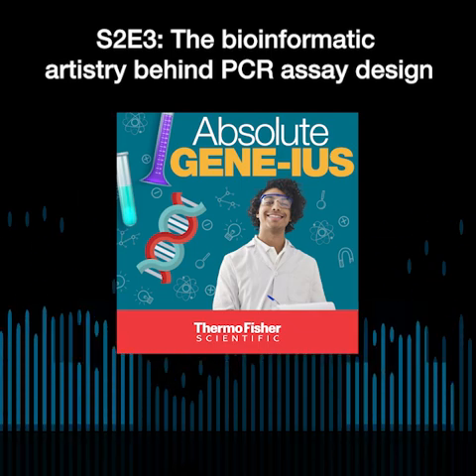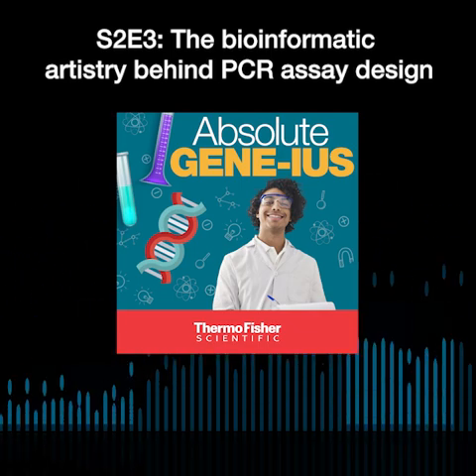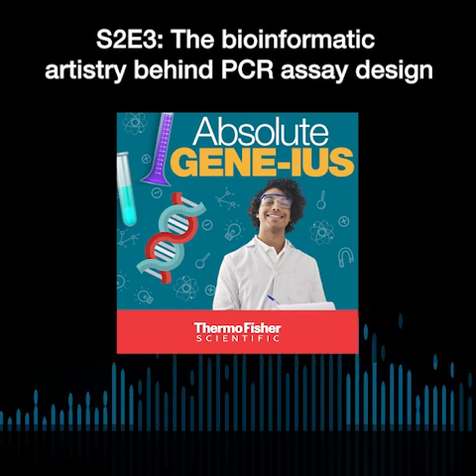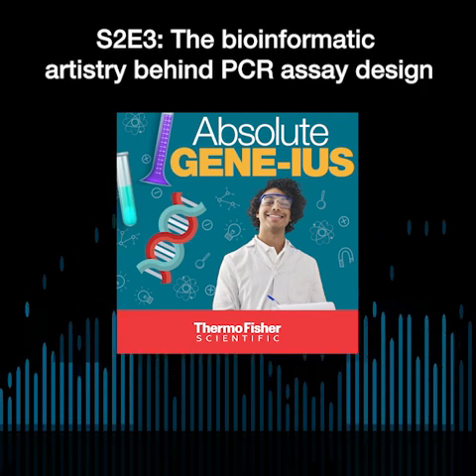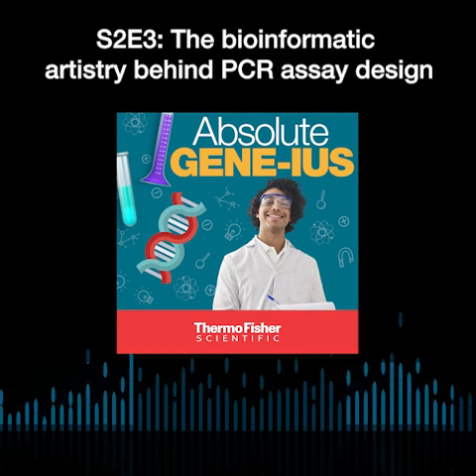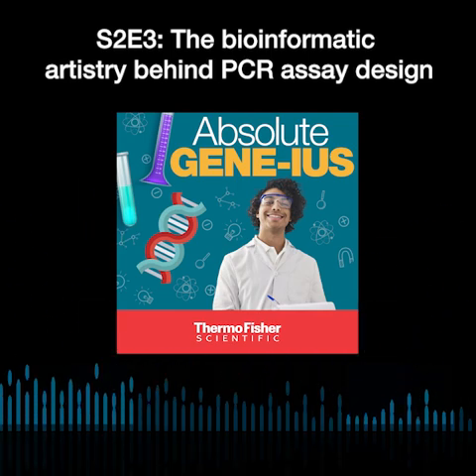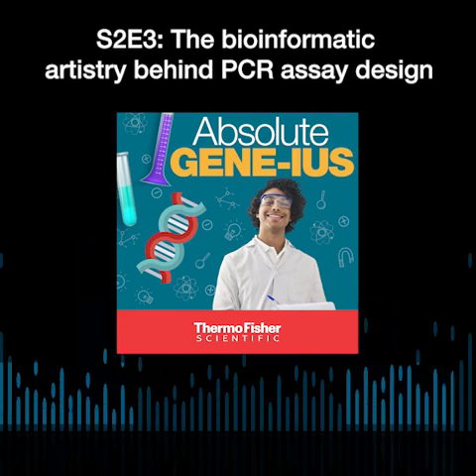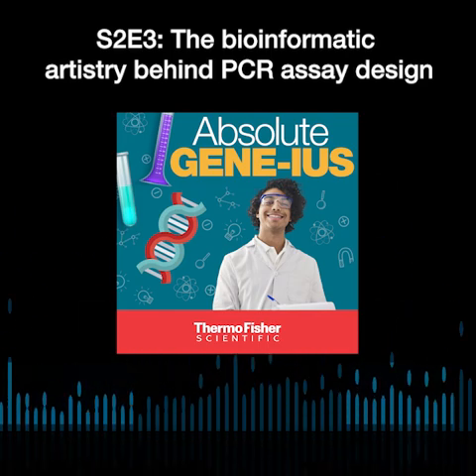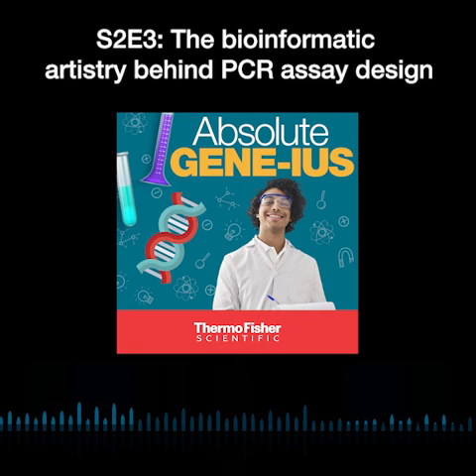Snaps to you guys. Another question for you. When you're troubleshooting, how do you know what is the tip-off that a reaction is not working properly and needs some additional troubleshooting? Generally, when we look at the 2D plots and we see how we would expect the signal to look, there is, I would say, a template of how we would like our signal to look.